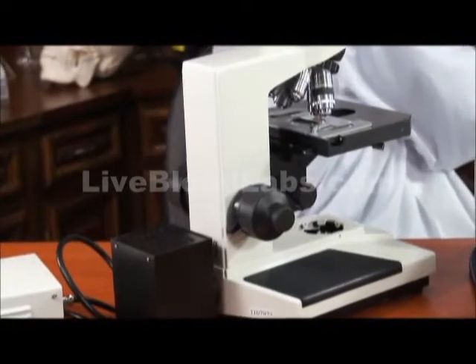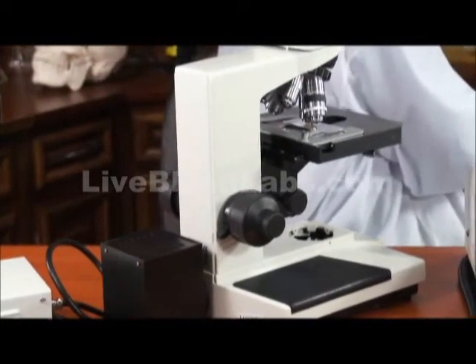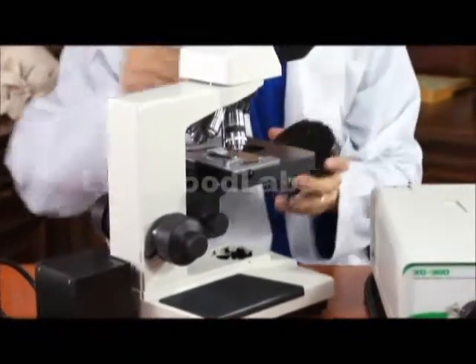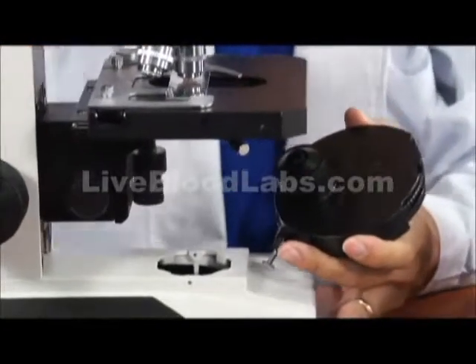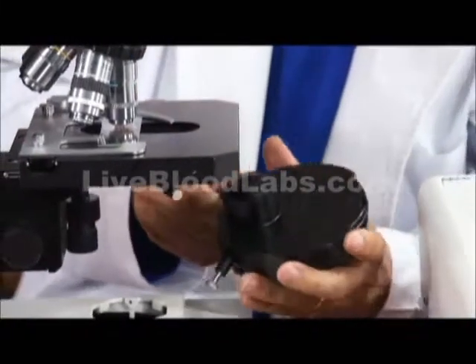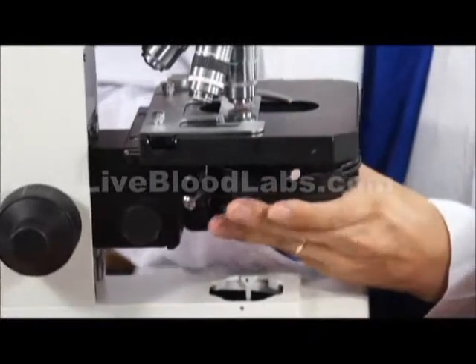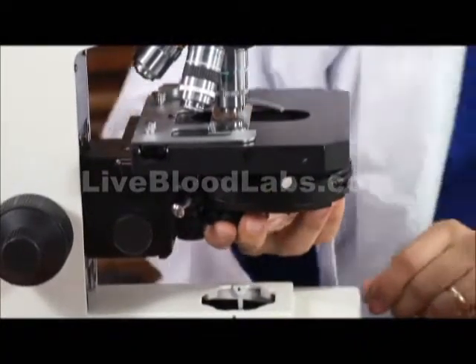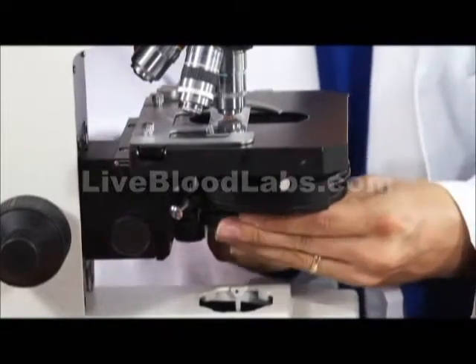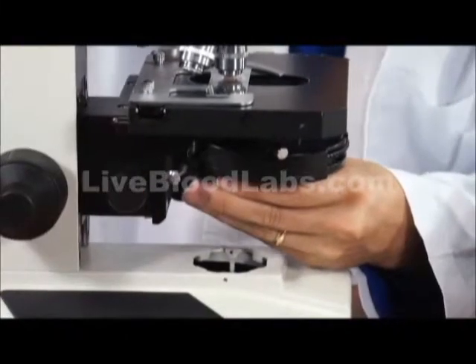We also have phase contrast microscopy capability on this microscope, depending on whether or not that's been purchased. Some models have it combined — dark field and phase together — and some don't have it. The condenser is put into place just like the other ones.